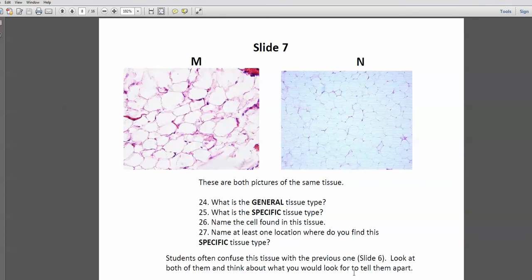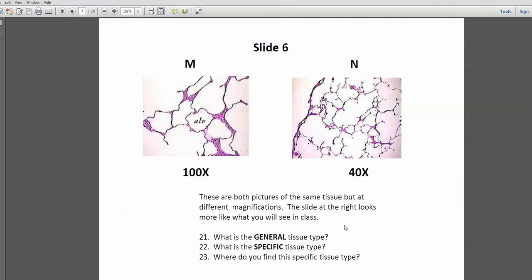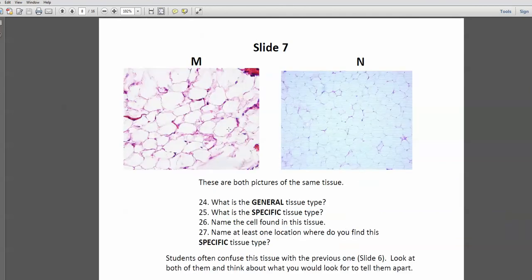Slide number 7 is often confused with slide number 6. Slide number 7, each of these spaces, or what looks like spaces, is actually a cell. These cells are filled to the brim with fat. And what cell is filled with fat? None other than adipose. Or adipocytes is the cell. Adipose tissue is the specific type of tissue. And adipose tissue, of course, is connective tissue. So the general tissue type is connective. Specific tissue type is adipose.